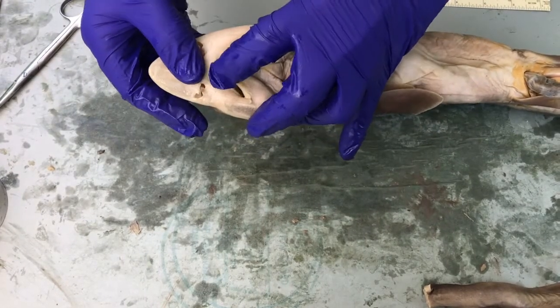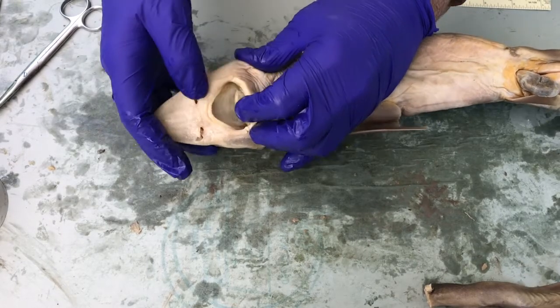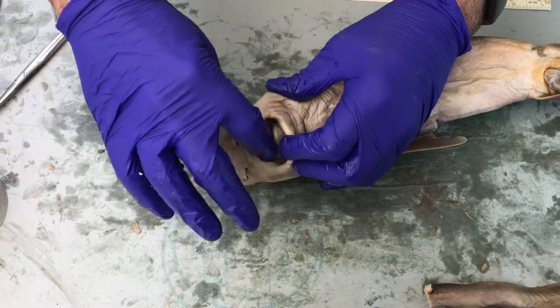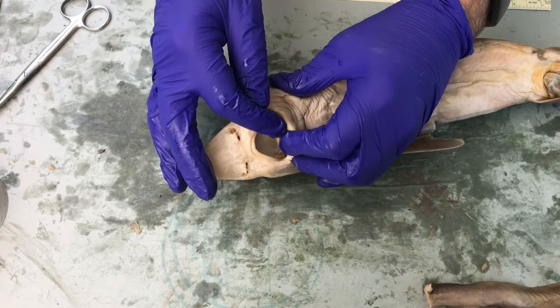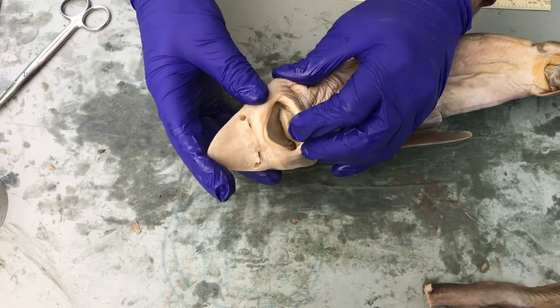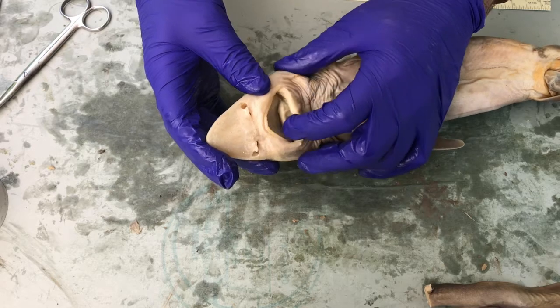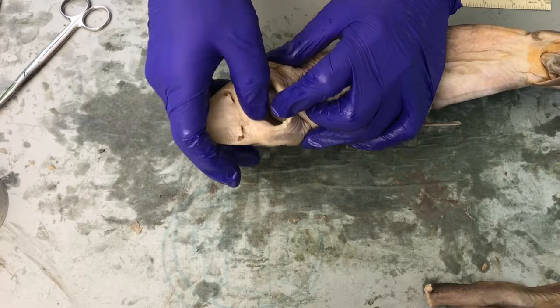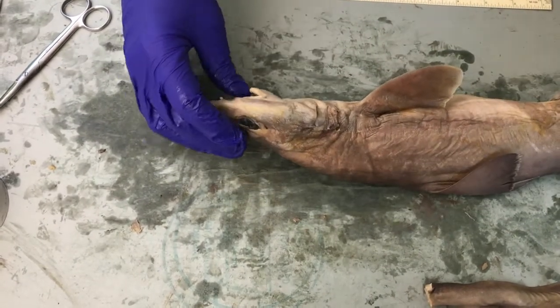The other thing that's different, the teeth here, they do have a little bit of sharp edge, but they're much more kind of a crushing plate kind of tooth, so I can run my finger over there without much damage. The teeth on the spiny dogfish, although not big triangular teeth like you would find on the great white shark, for example, are quite a bit sharper, and you can cut yourself. Though they're relatively small like these, much easier to cut yourself on those.